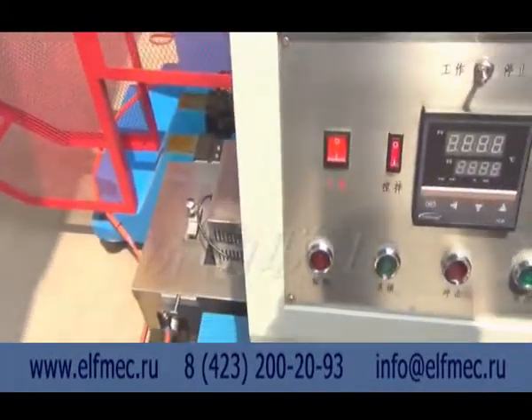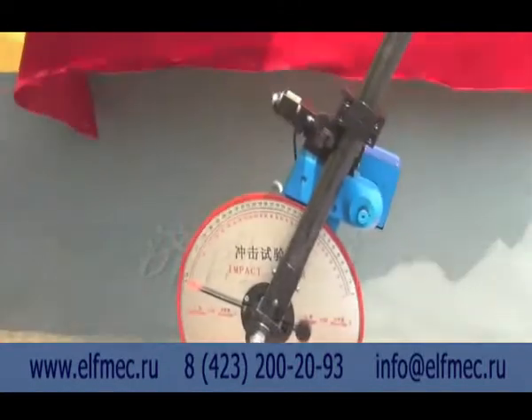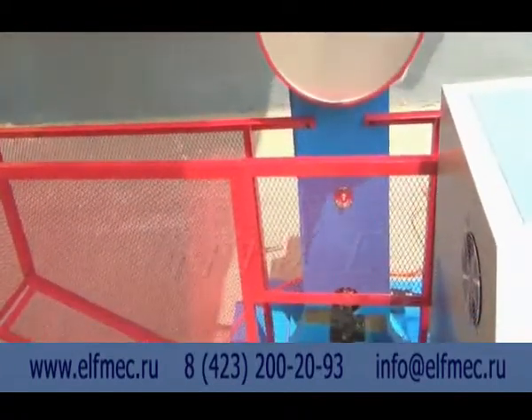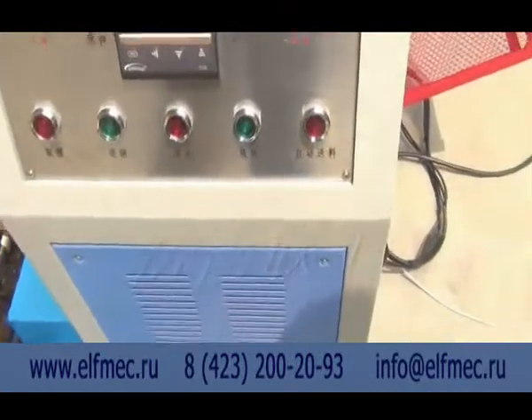Open the power supply of the host, press the take pendulum button, press the automatic feed button, and check the sample outlet conditions and whether the cylinder operates regularly. Please refer to the instruction book for detailed adjustment.